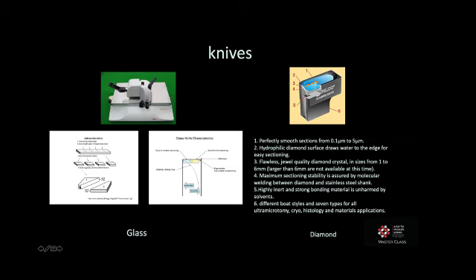So if you're making multiple knives for different purposes, you want to choose the best ones for your final cuts, and you would judge the best knife based on the quality of the foot or its opposing side. If we turn this knife up, so we're looking at the cutting edge, we'll see this stress line, which is the fracture line. And this will also tell us the best parts of the knife to use.